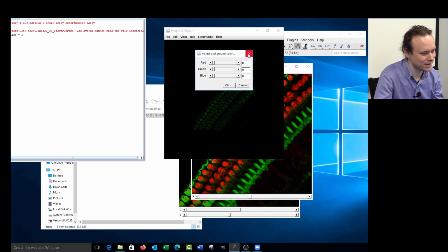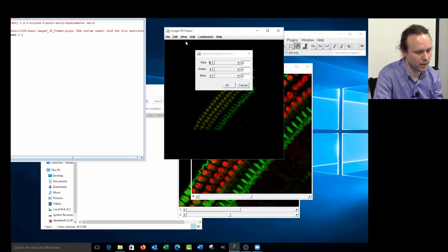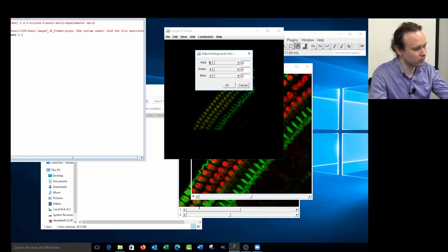Well, this one just doesn't run on this computer, unfortunately. This one has the ability to make little movies that rotate through the sample automatically. If you're on a bigger computer, it's under View, and it will take a 360 recording at any arbitrary axis you want. It makes that into a stack, and then you can export the stack as itself, or as a movie or as a GIF. We can go over that on the next one. I'm going to just close FIJI again.